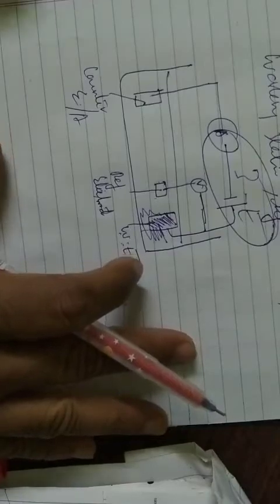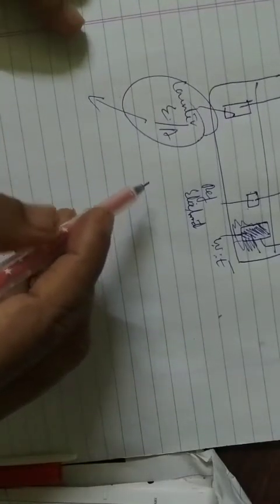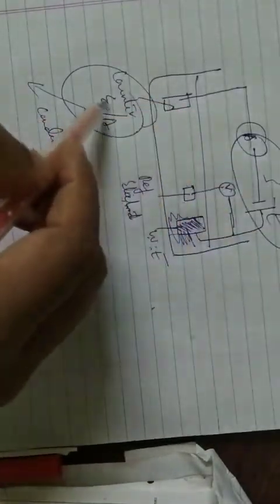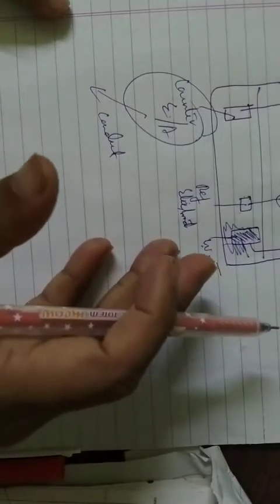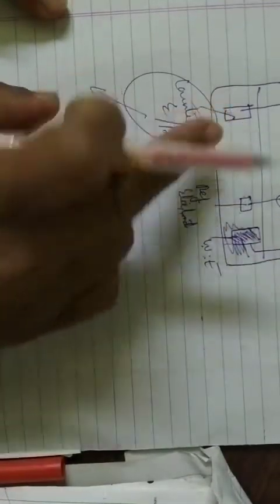Whatever this counter electrode is made up of, it should not have any reaction with the analyte solution, and it should conduct the current well. This is very much important. You can see the whole thing is maintained by this counter electrode. You can make it from any material. The only thing is that this auxiliary electrode should not react with the analyte, and it should conduct the current very well. So this is about the auxiliary or counter electrode.